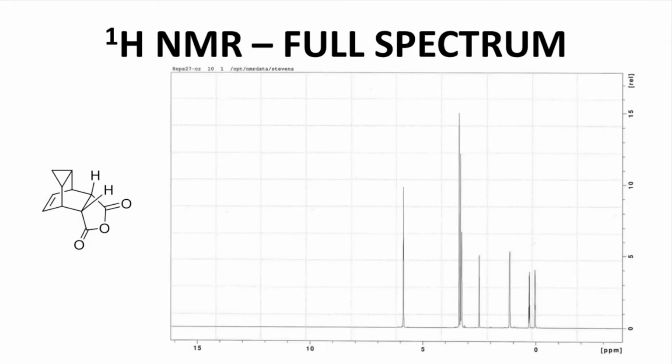Here is the full NMR spectrum. On first glance, everything looks good. The baseline appears relatively free of extra little peaks. The spectrum was obtained in deuterated DMSO, D6 DMSO as the solvent, so we will have residual solvent peaks.